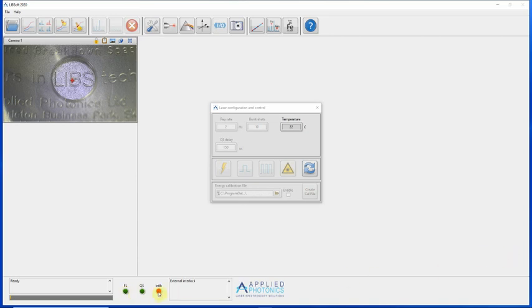The interlock indicator in the status bar has also changed colour, but this time from green to red, and the source of the interlock error is displayed in the panel to the right. The manual laser controls and the acquisition initiation button in the toolbar have also been disabled and greyed out. The laser flash lamp can't be restarted and then the Q switch enabled until all interlocks have been satisfied.